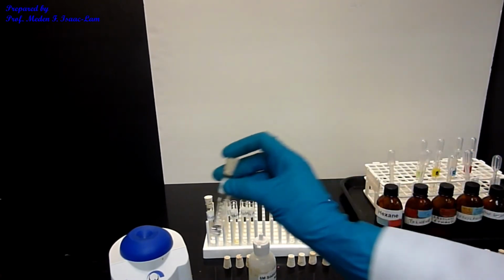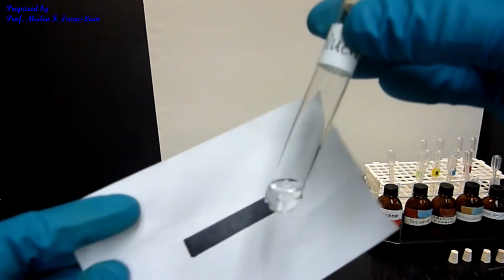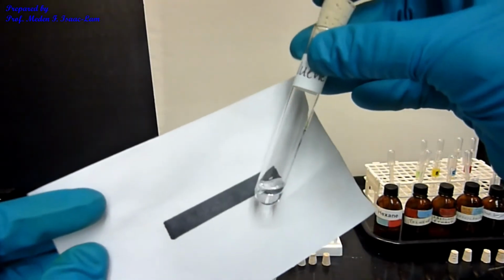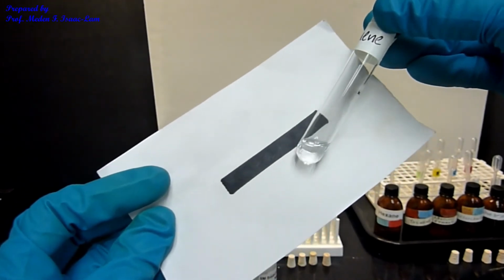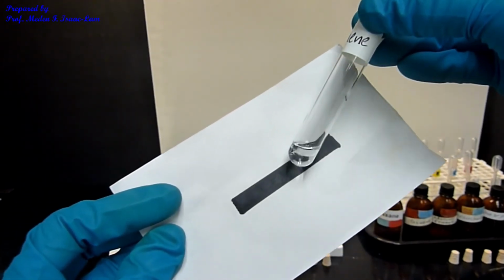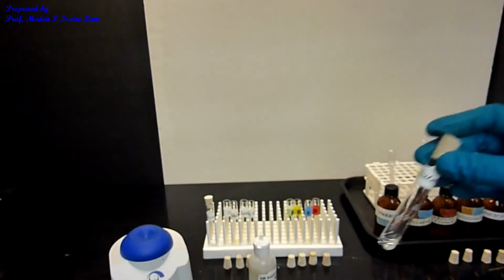Okay, so I have here toluene, so you can see, don't know if you can distinguish, there's some kind of separation of the layer. Okay, that's toluene.